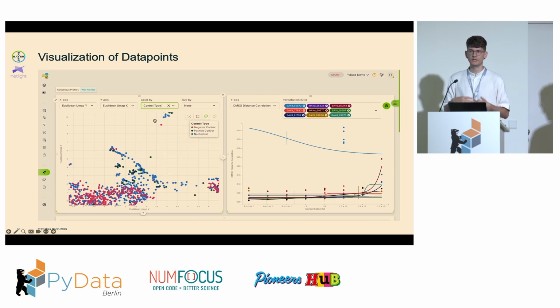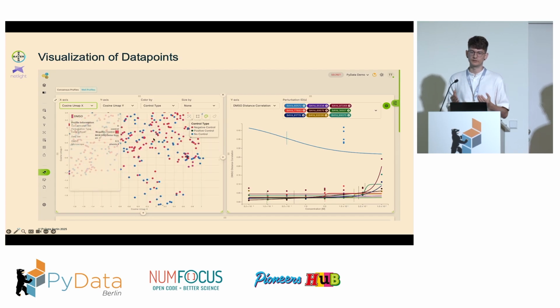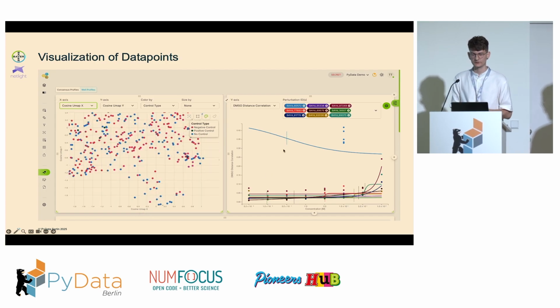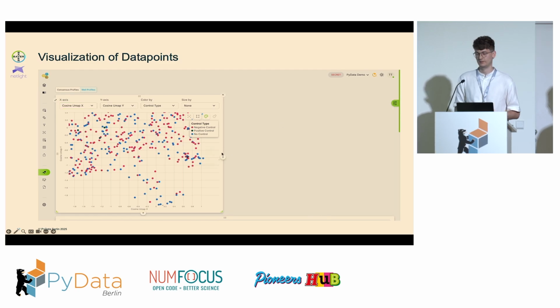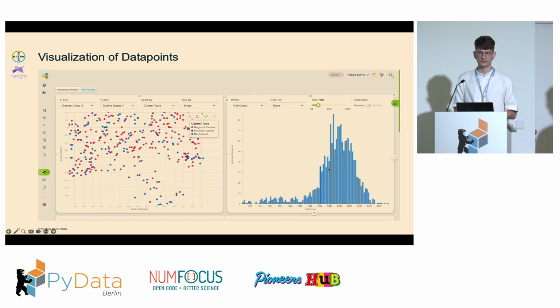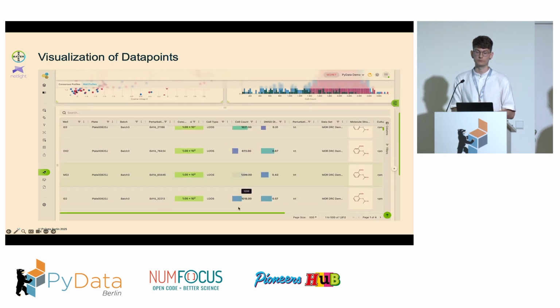And as I've explained, we built this with the intention to be maximum adaptable for the use case. So we allowed our researchers to look at different widgets, but also bring in the widgets that they might want. So here you see a dose response curve. But if I don't like this one, I can also look at a histogram and, for example, color the histogram by the same control type that I have in the scatter plot to create some kind of correlation between widgets.